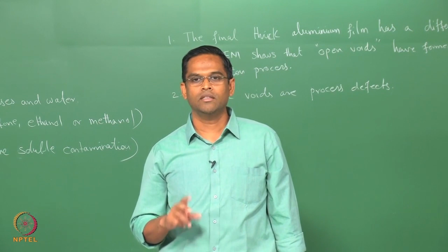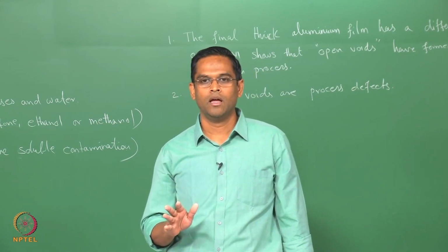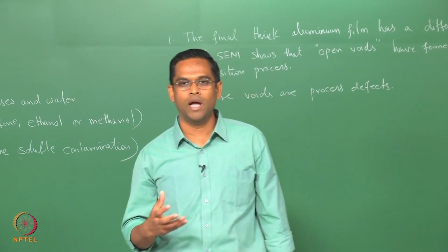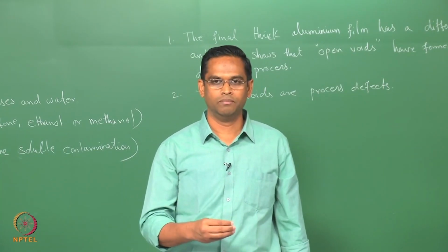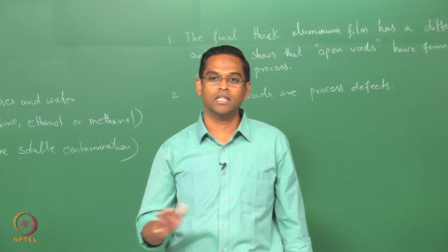That is, either the magnesium and silicon could be a segregation, but to make that conclusion you need to have a theoretical background about the solubility limits of magnesium and silicon in aluminum. Once that is confirmed, then you can conclude this as segregation, otherwise you cannot.